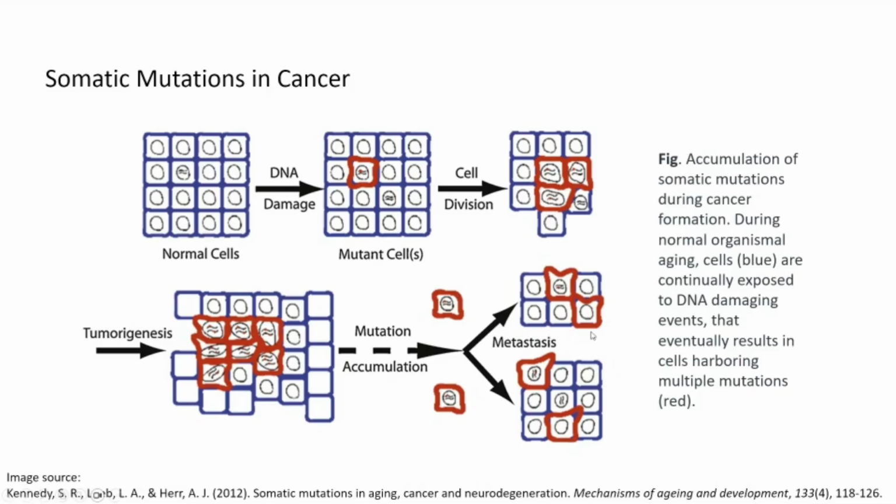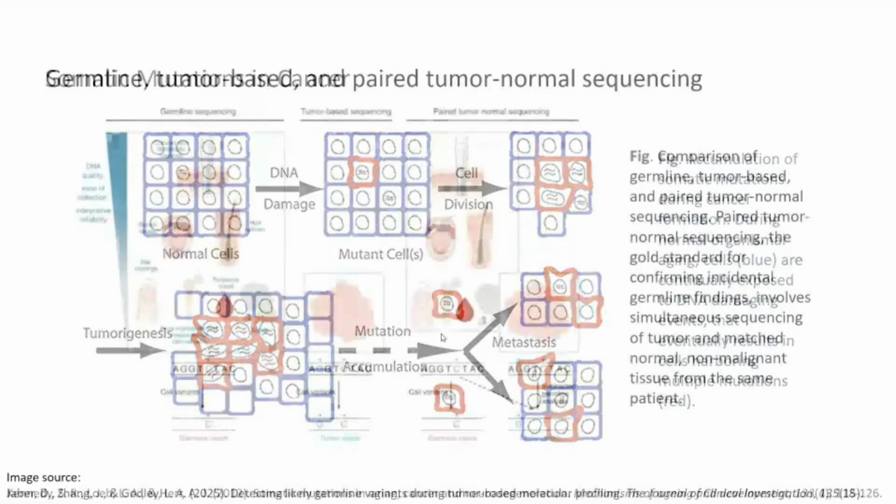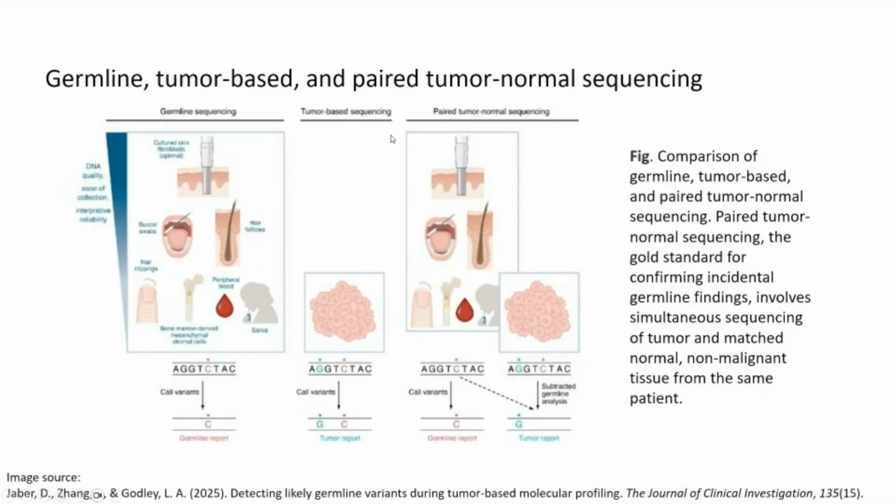So when we study cancers, we would like to know what mutations are carried in the tumor cells compared to the normal cells. That's why somatic mutations or somatic variations are normally the focus of cancer cases. For identifying somatic variations in cancer samples, from the DNA sequencing data we are seeing the differences between the samples and the reference. And how do we know whether some of them are germline variations or somatic variations?